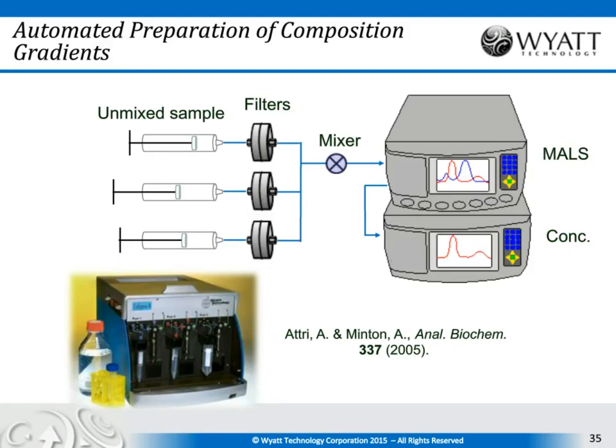CG-MALS is carried out with this multi-syringe pump system. There's computer-controlled syringe pumps that inject different amounts of sample through filters and mixers and all the kind of preparation that you need. That's what the Calypso does, injects into the MALS detector, a DAWN or a miniDAWN MALS detector and concentration detector. And again, the relationships between light scattering and concentration give you the molecular weights, which are analyzed in the Calypso software to analyze the KDs and stoichiometries.